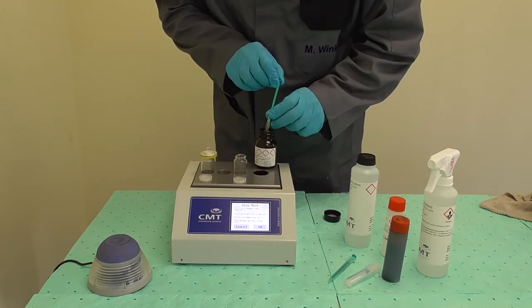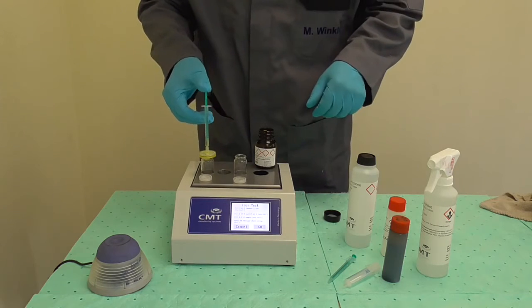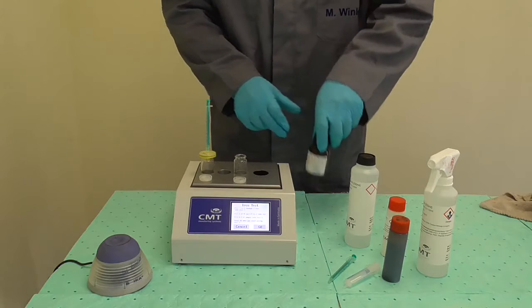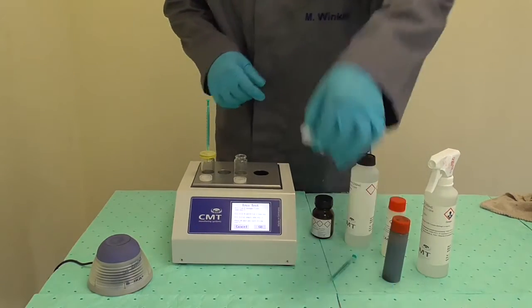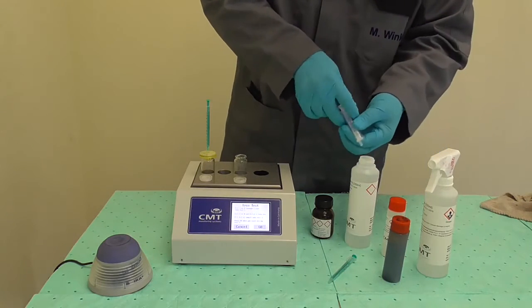Connect the one milliliter syringe to the filter on the vial and filtrate all of the syringe's content through the filter. When the syringe is empty, only a few drops will have come through the filter and into the vial. Leave the filter on the vial and close the bottle of reagent P.